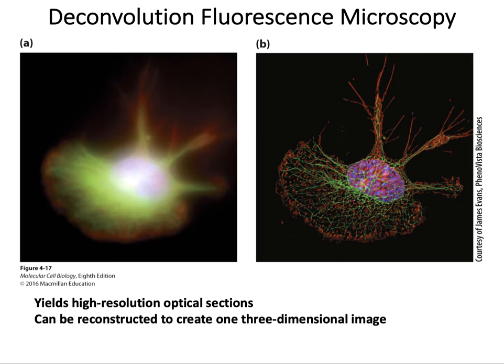In the same way, the 4 and 5 micron planes below the 3 micron level are out of focus as well. So when you are visualizing the 3 micron plane in perfect focus, out of focus light from the planes above and below the 3 micron plane is also contributing to the image, and you get an overall blurry image, just as shown on the left side of the figure.